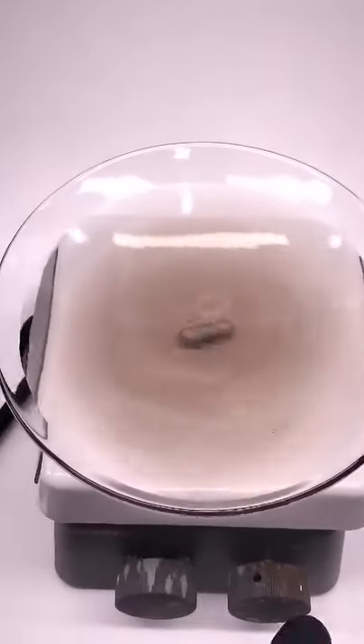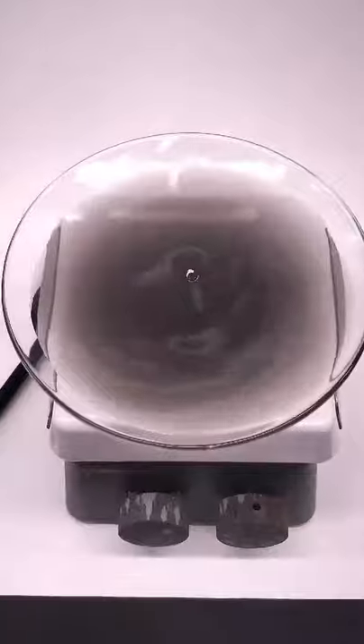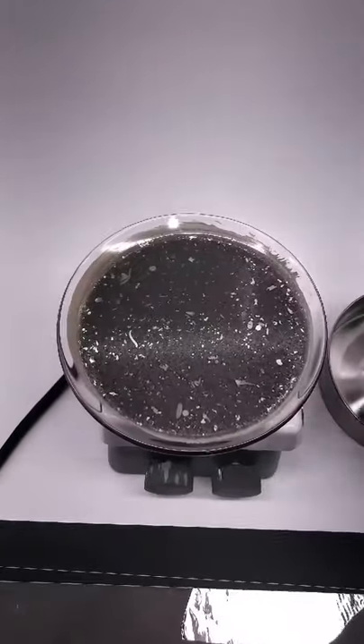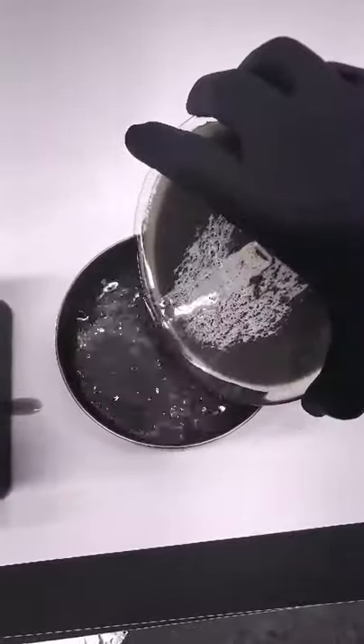It's already darkening, because small particles of silver are separating out, and I just need to leave it like this for a while. This is 15 minutes later, and now when I pour off all the water and flip it over, there's a nice mirror on the back.